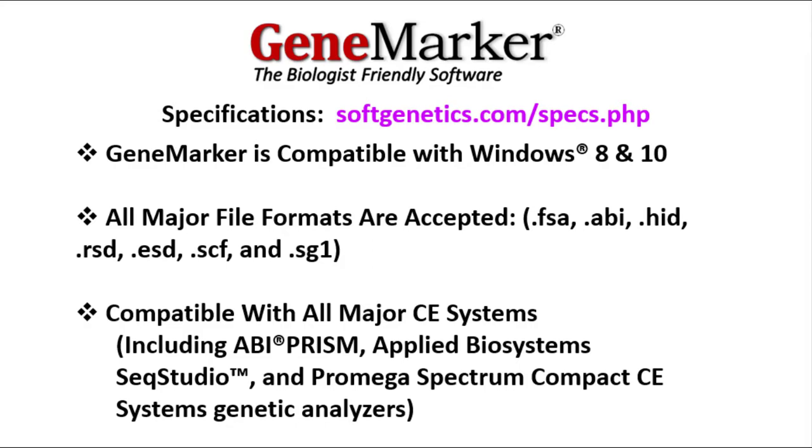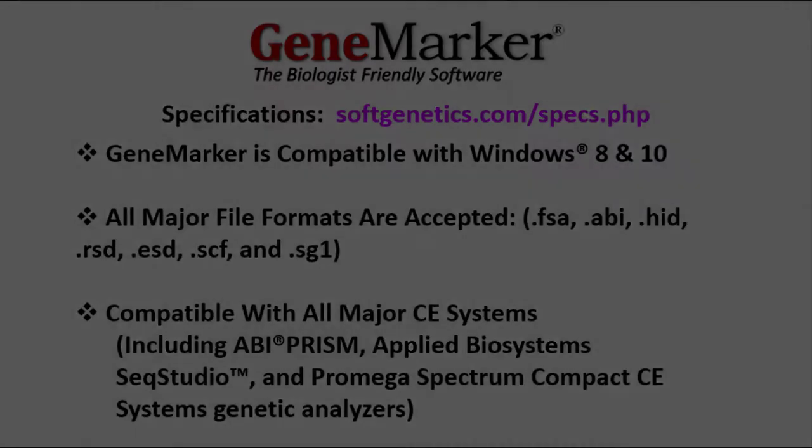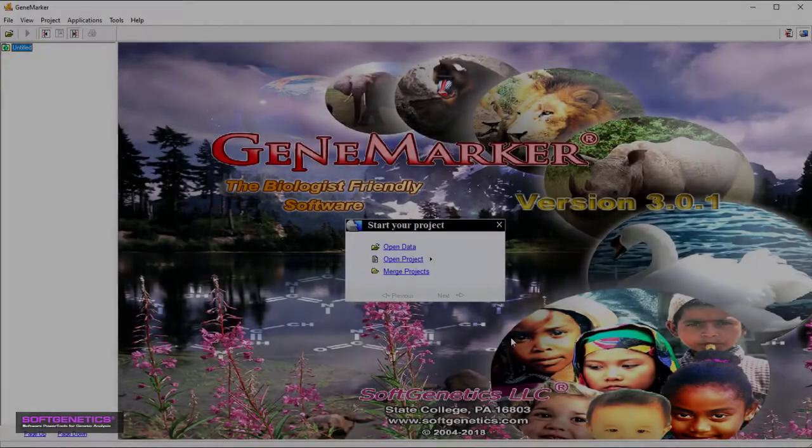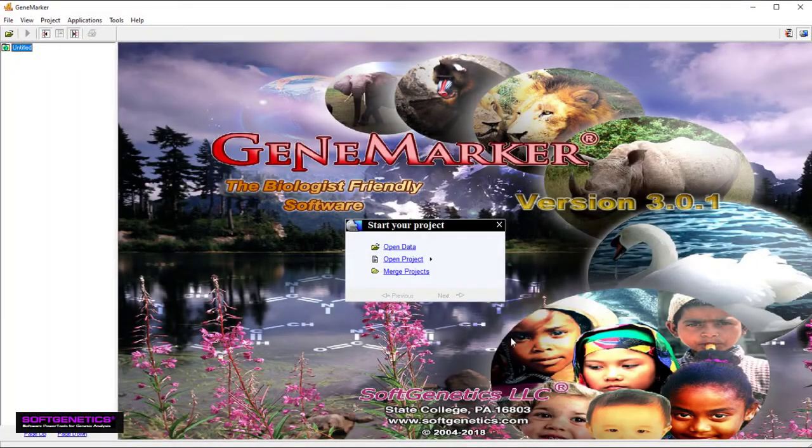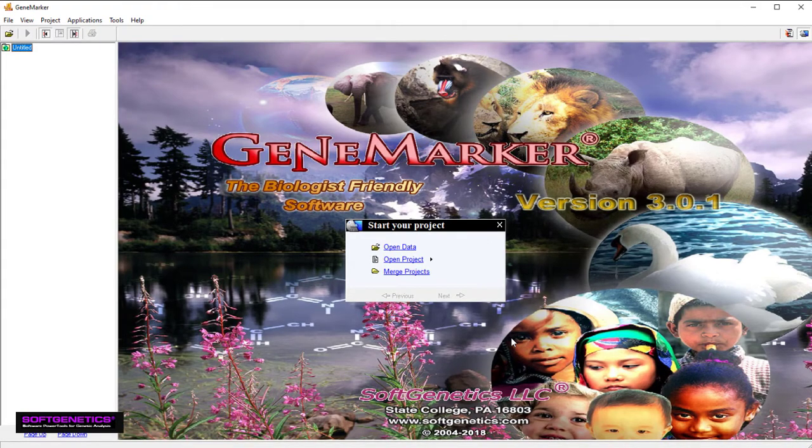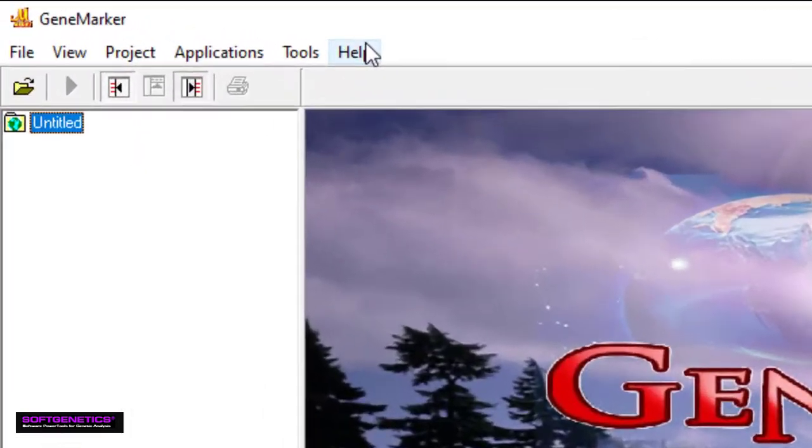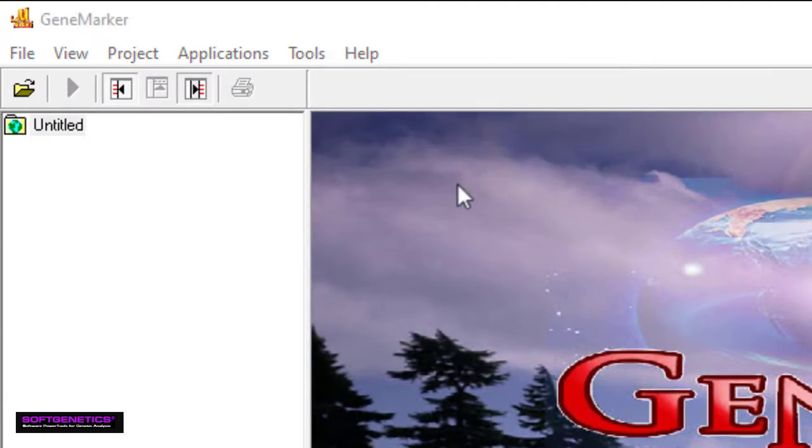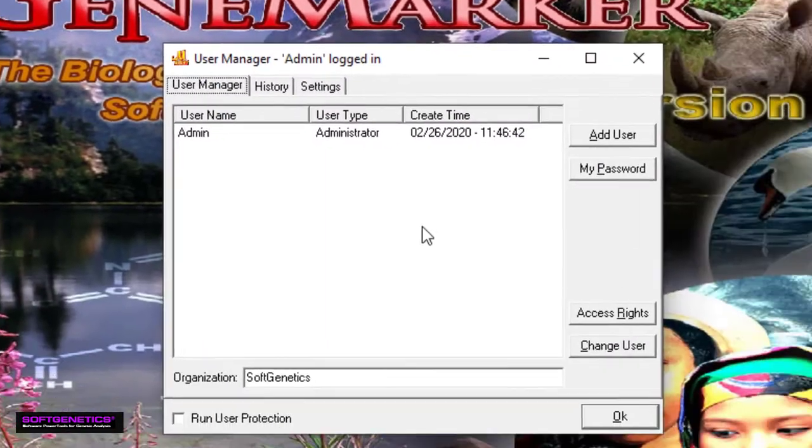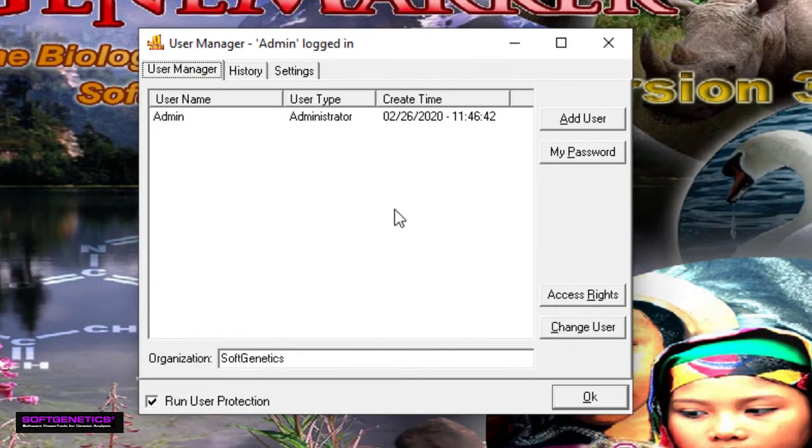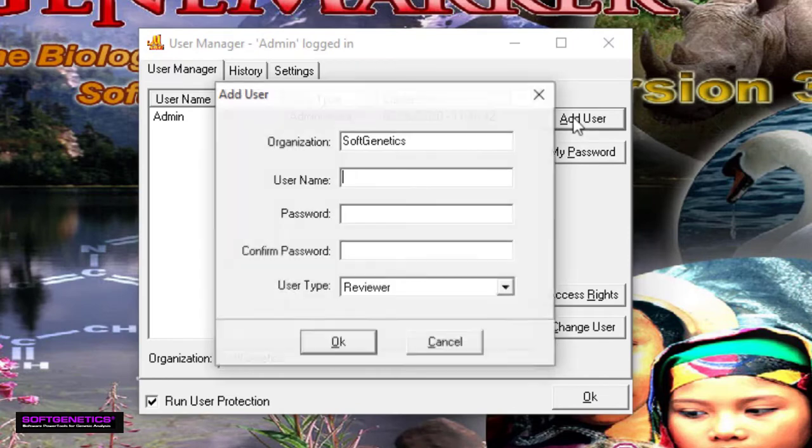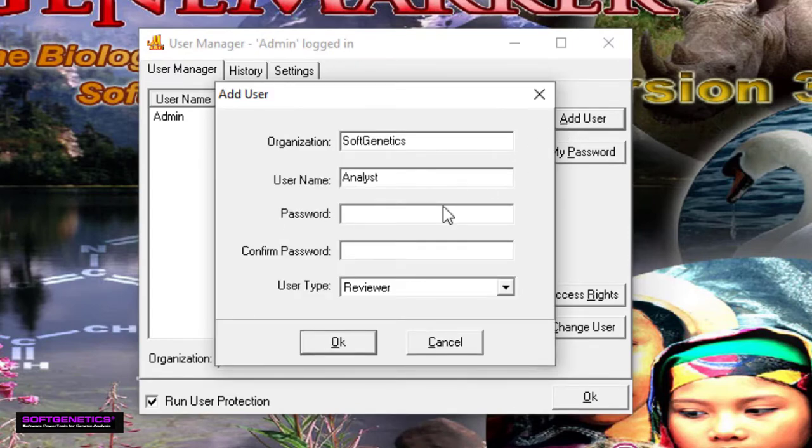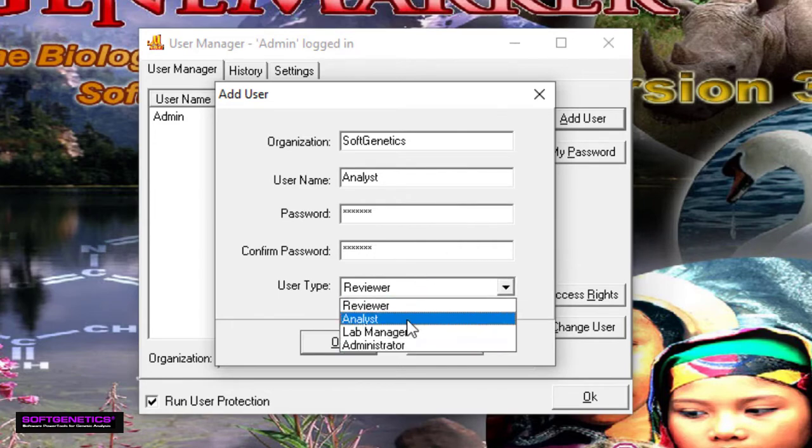The first thing I'd like to show you is user management. We're now at GeneMarker's title screen, and from here you can set up user management by simply going to Help, User Management. After you've given a password to the administrator account, adding new users is easy. Just click Add User. Give the new user a name and a password, select a user type, and then click OK.